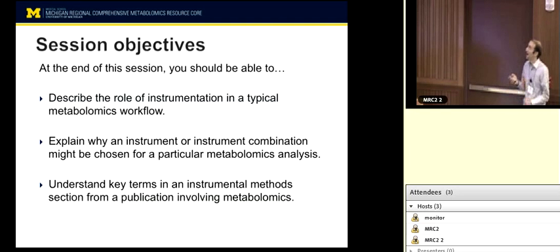Okay, what tools are needed? Metabolomics, as I said before, is the study of all small molecule components of a cell, tissue, or organism. How are you going to address that? You've got many different compounds in a range of different concentrations. We might need to quantitate something that's very abundant, glucose or lactate, in a sample at the same time as we're quantitating something much lower, like a thyroid hormone or a steroid. And we're interested in all of it. We want to be able to look at it all.